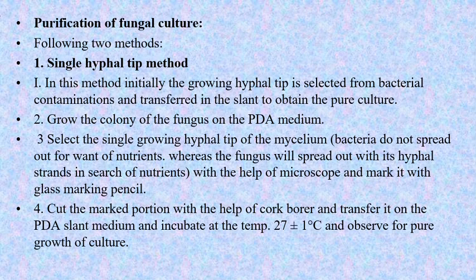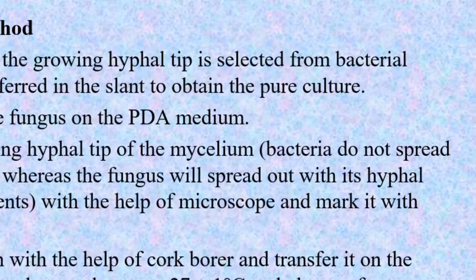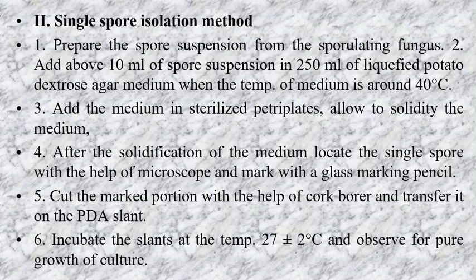With the help of a microscope, mark it with a glass marking pencil. Cut the marked portion with the help of a cork borer and transfer it onto the PDA slant medium and incubate at 27 degrees Celsius and observe the pure growth of fungal culture.